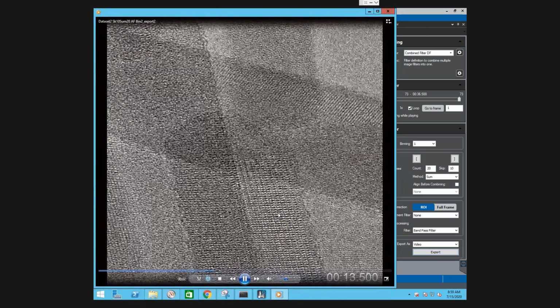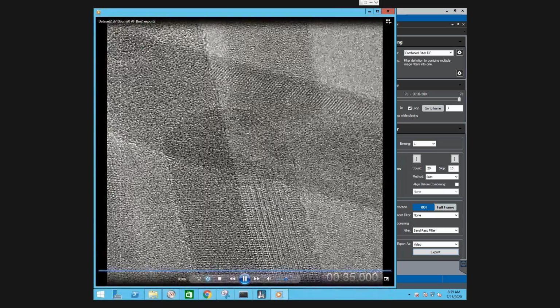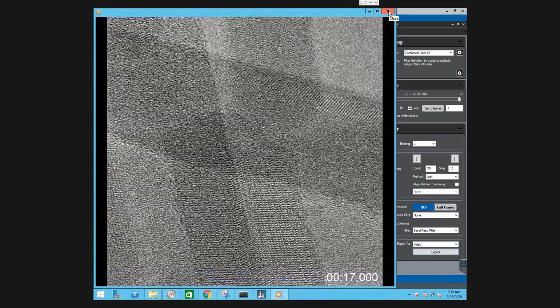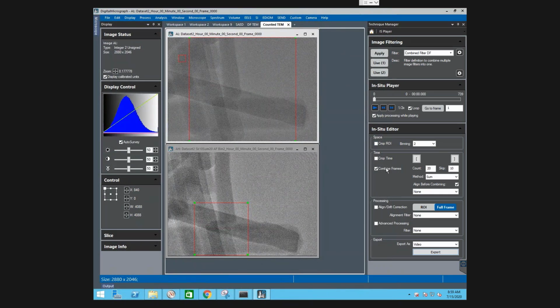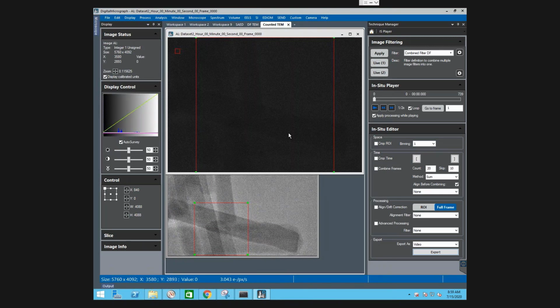But we can actually see in this video the degradation of this material over time, and it's quite a nice result, I would say, and something we could certainly put into a presentation. And so from something, let's go back to the original here, something that looked like this and didn't look like much. There was good data here, but it wasn't much to look at.